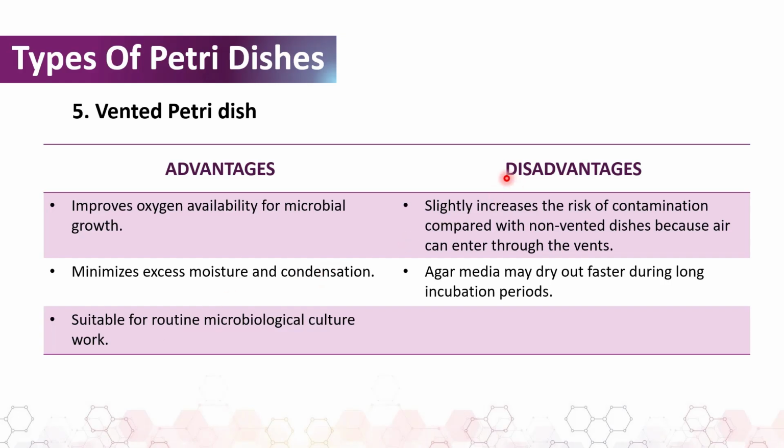And for the disadvantages, it slightly increases the risk of contamination as compared with the non-vented dish because air can enter through the vent. And the agar media used may dry out faster during long incubation periods.